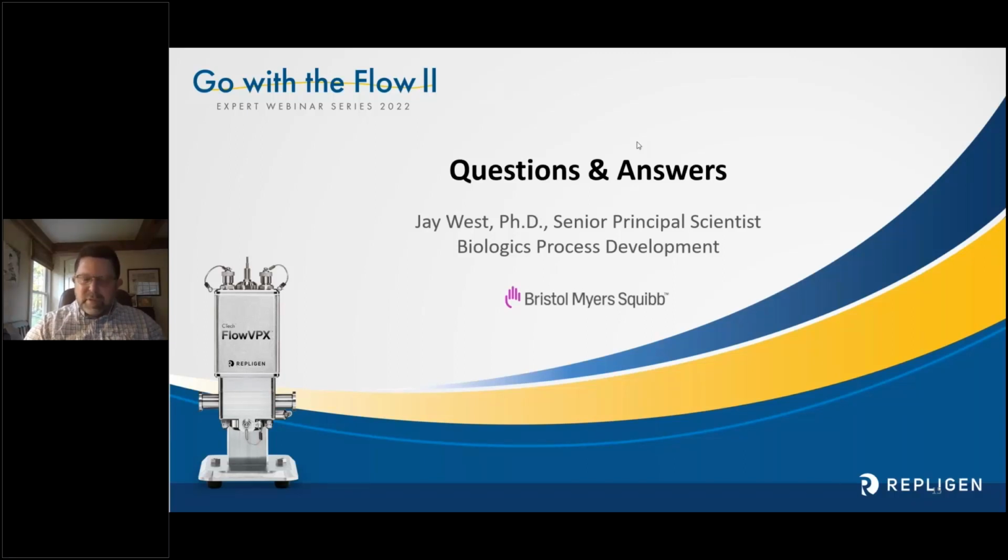Okay, next question. What would you recommend as validation parameters when considering implementing inline concentration methods such as the FlowVPX during a UFDF process?